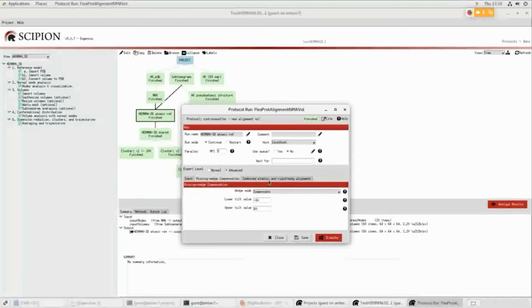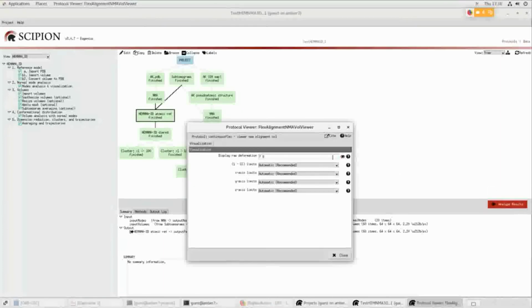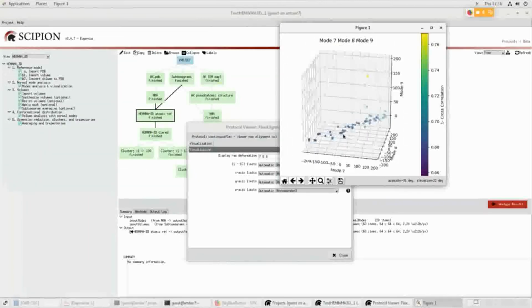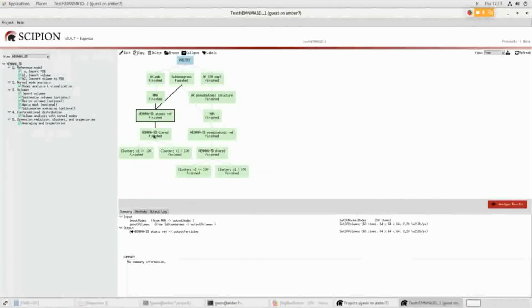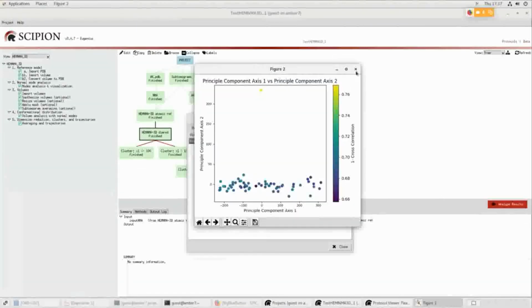And you will see with which parameters we worked to compute this, and you get something like that. Again, you can, I think, show it in 3D because we used 3 modes here. And similarly, you can get to the 2D reduced space.